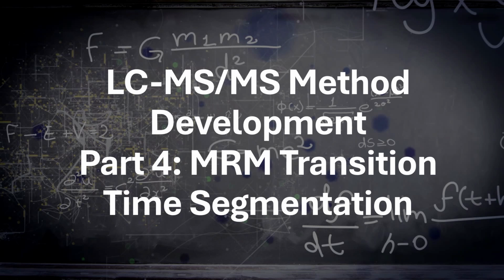Today we are diving into part 4, MRM transition time segmentation. It is a powerful technique that can dramatically improve your method's sensitivity, data quality and overall performance. By the end of this video, you'll understand what time segmentation is, why it's crucial for multi-analyte methods, and how to calculate and implement it effectively in your own work. So let's get started.